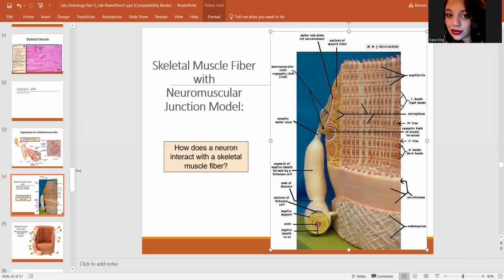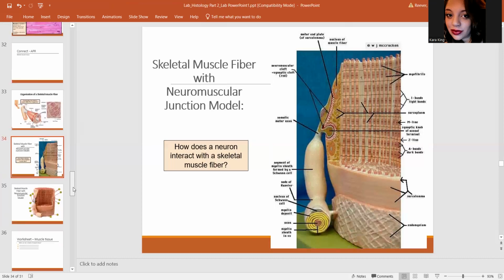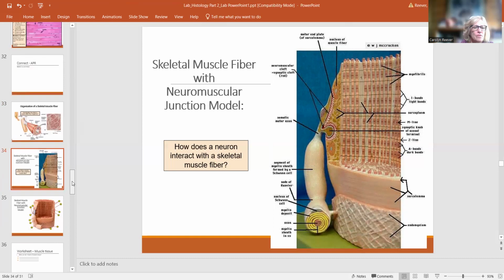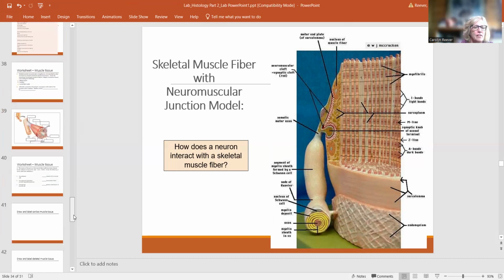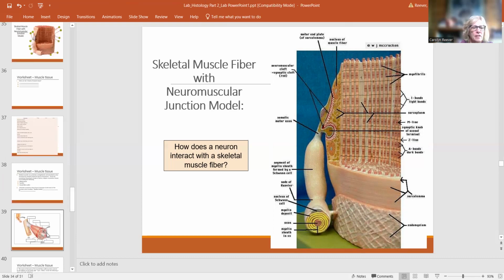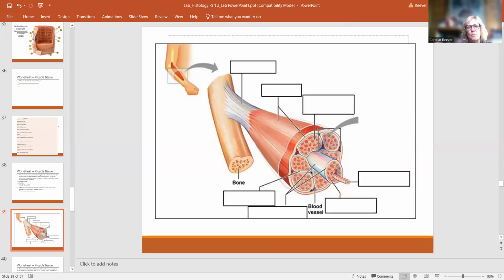Let's go. Let's see if there's anything else in this neuromuscular. Where's the nerve? The nerve cell itself, I was trying to find. Okay, those aren't coming up yet. Well, we want to do this one? Sure. Leah, do you want to? Go ahead. Let's start up here. You guys can just say it, either one of you.